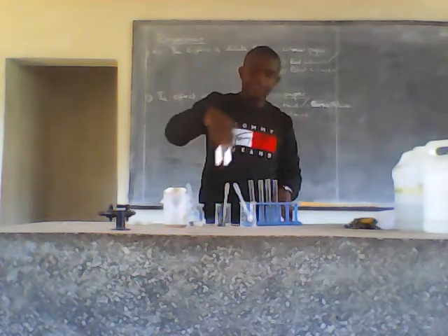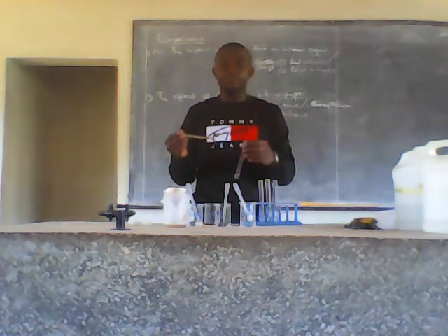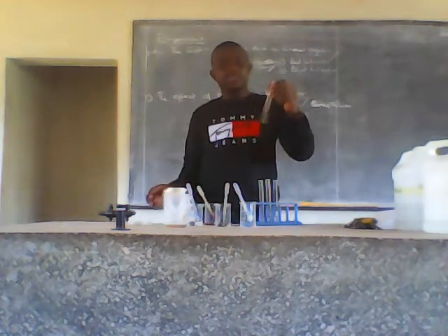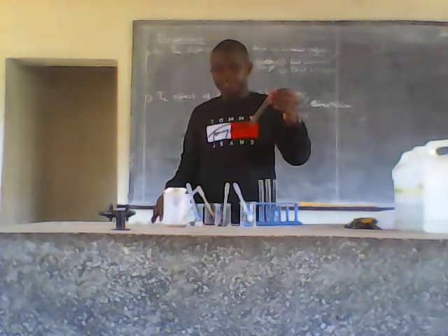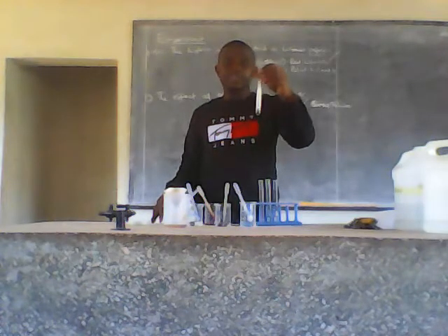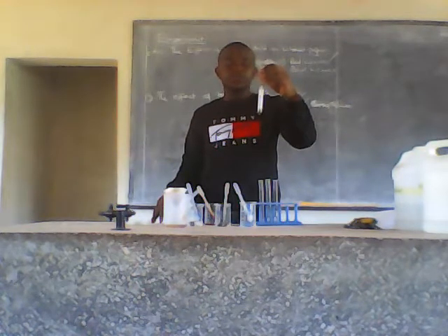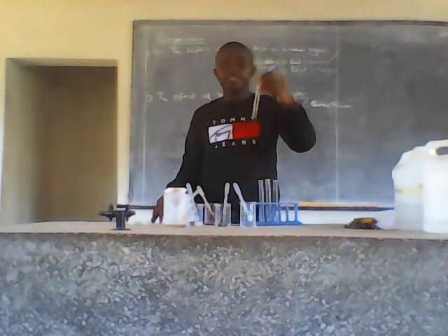For the first test tube, I have added two cubic centimeters of the universal indicator. Then I'll shake the test tube. As you can see, after adding two drops of the universal indicator in the filtrate, I am getting a green solution. So the solution gives a green color after adding the universal indicator.